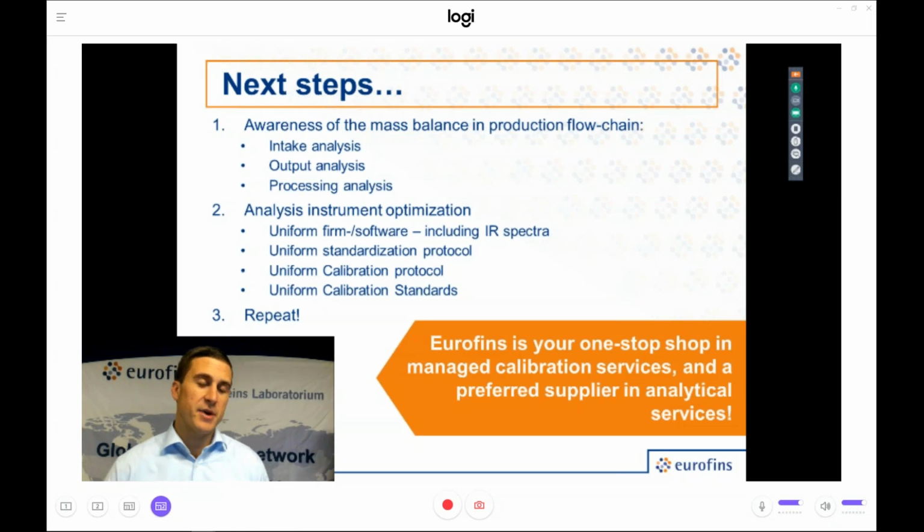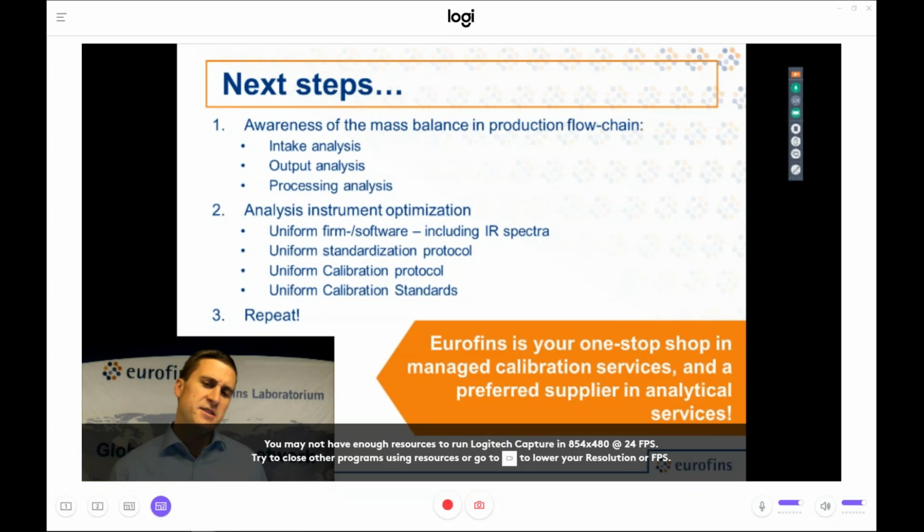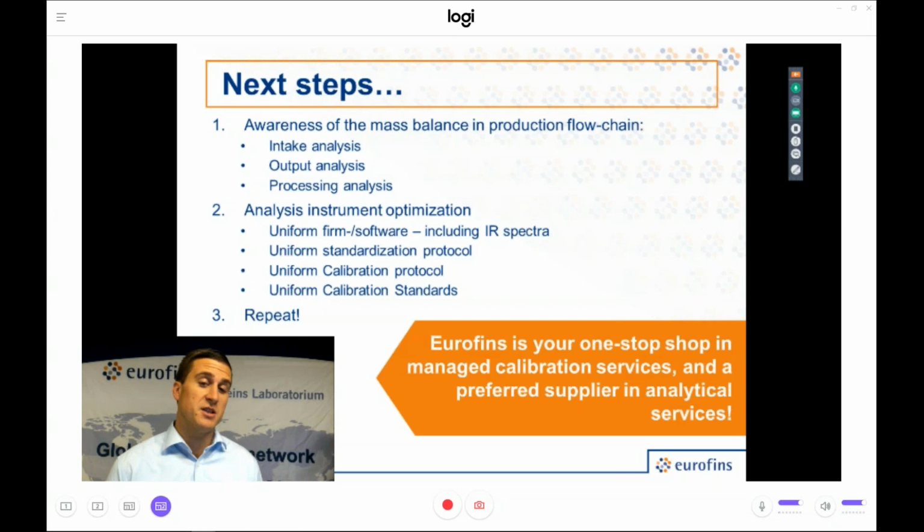Because most of you will definitely measure a product, and the instrument will probably tell you the correct or an answer, but that answer we have to ensure is as correct as possible. So an analysis instrument consists of many features, and we often see that the software or even firmware at the instrument might not be alike, even at the same dairy plant, which might have 2, 3, or 4 different instruments or the same instruments, but they will eventually have different software versions on these instruments. That's definitely a no-go. One has to have uniform instrument software in order to perform at least somehow adequately. Then you will have to have a standardized protocol for calibration purposes, which means that you must standardize how often you do it, how you do it.